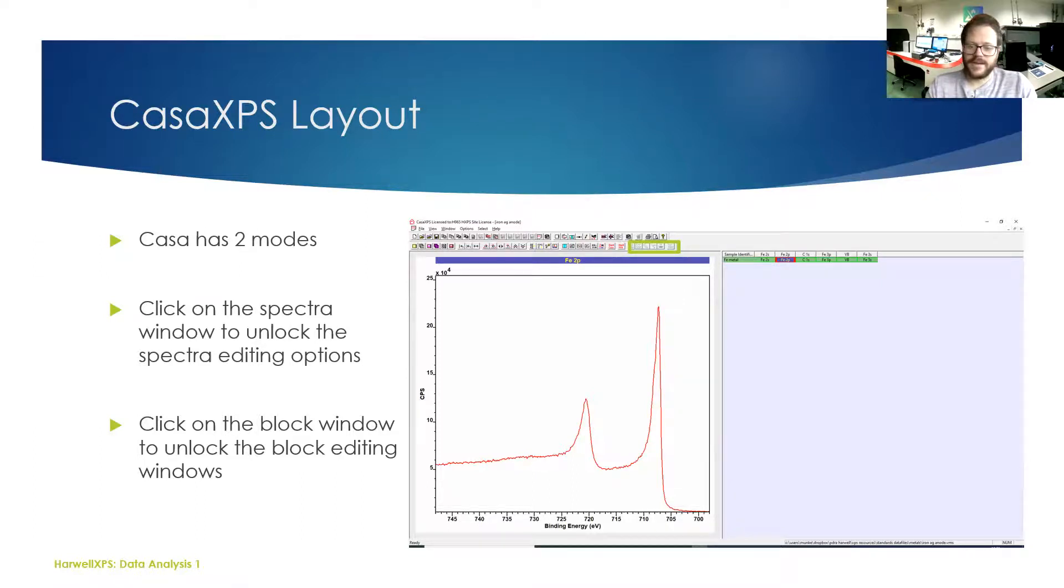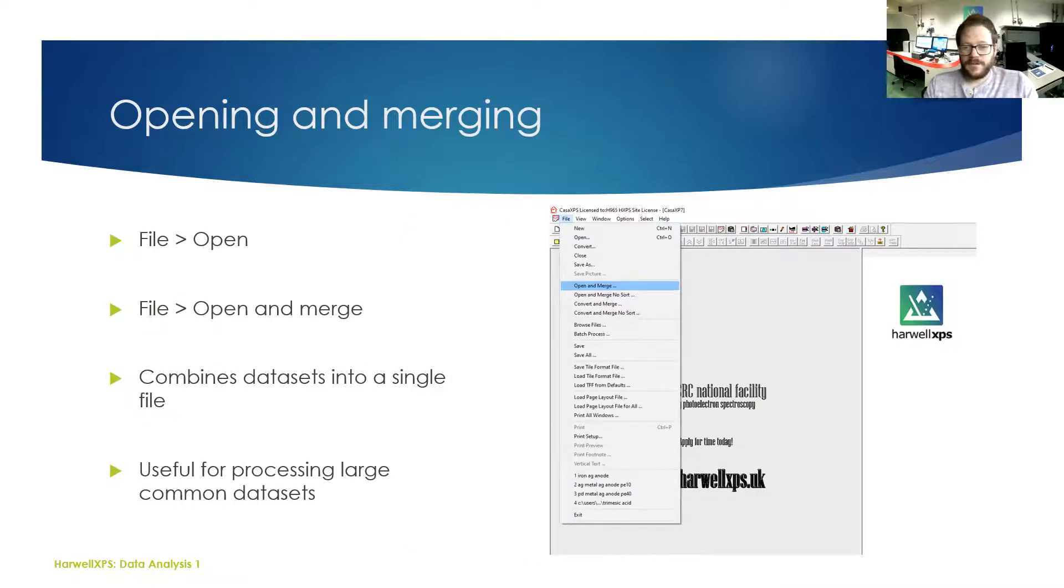Getting started: opening and merging files. Opening files is pretty straightforward: File, Open. If you have multiple VAMAS files with lots of different spectra from samples that are all in a series, you might want to open and merge those. This just enables you to combine lots of data sets into a single file. It does make it easier if you are processing large data sets where you might want to copy models from sample to sample.